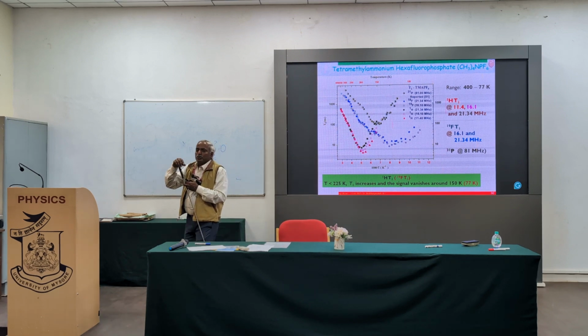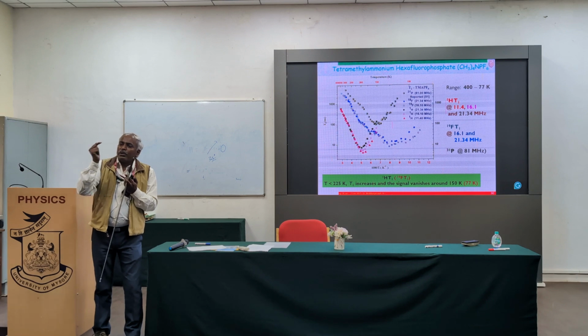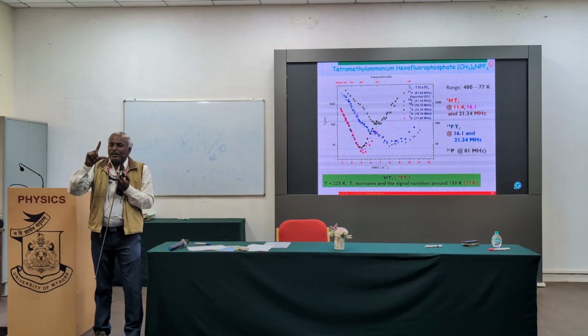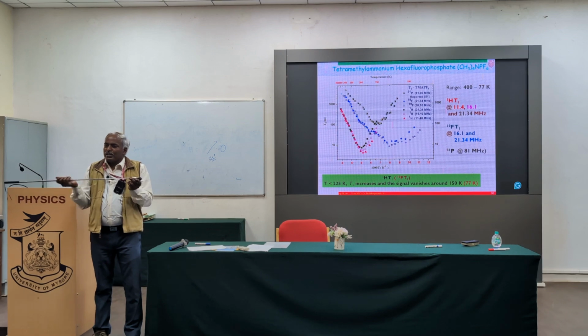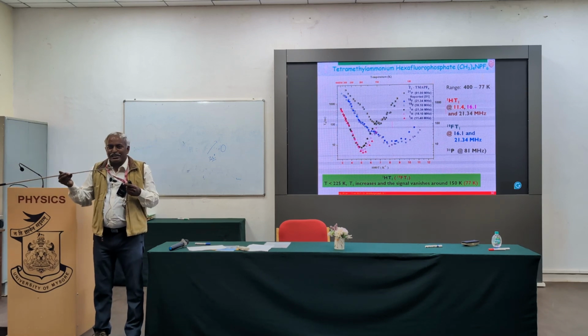But what we used to do, whenever we take a coil, the coil is big, and my sample, after keeping it several times, becomes expanded. Then whenever I keep it, it is so loose. For that we used to wrap it around with Teflon, make it tight and keep it easy.